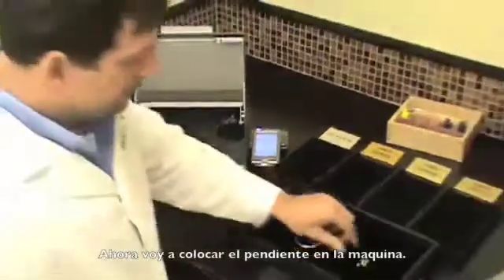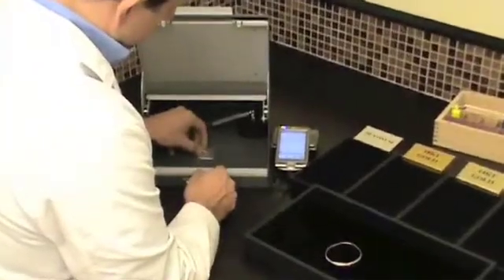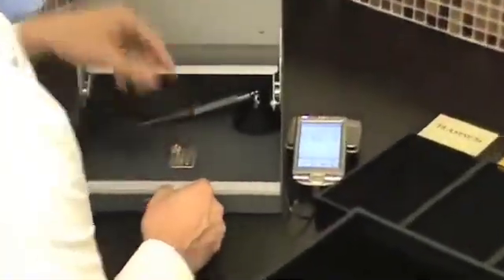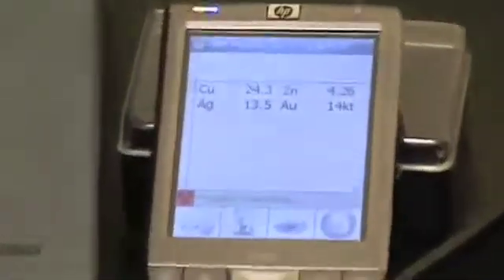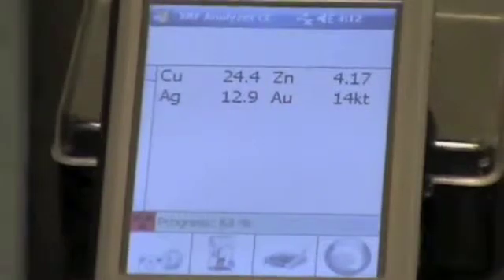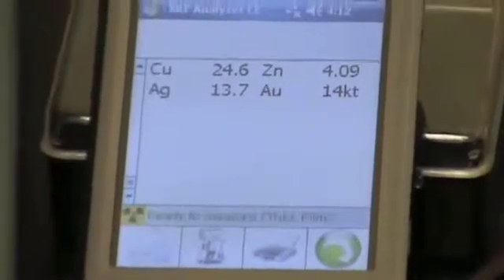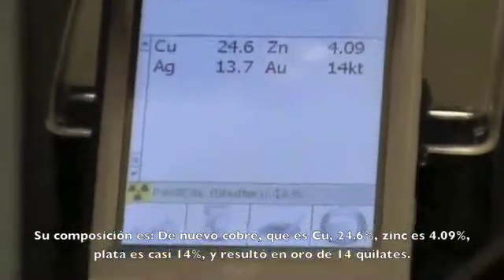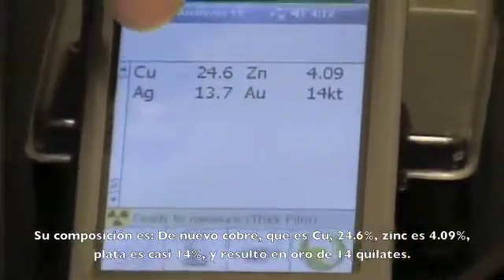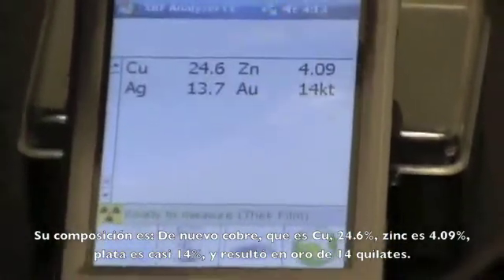So now I'm going to place the earring in here and let's see its composition. Its composition is once again copper which is CU at 24.6%, zinc at 4.09%, silver at almost 14%, and it's testing out at gold at 14 carat.